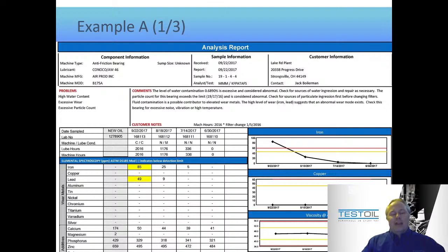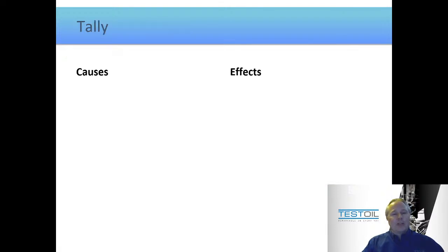But now as we get to the actual data part, all we have to do is, like I said, identify abnormal data. And the first piece of data that most people identify as abnormal, well, would be the iron, of course. So they see the iron, and like I said, all we have to do is decide if it's a cause or an effect. And I gave you a bit of a hint. So if we're keeping track here, it's an effect, right? Let's just call it an effect.